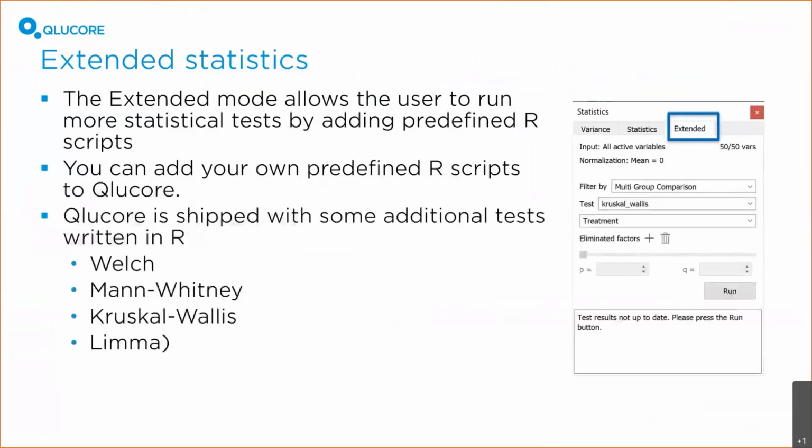Okay, so then I will move on to the last piece of this webinar. So no questions so far on the Biomarker Workbench? No? Then we'll continue. So in the extended statistics, you can run R scripts.